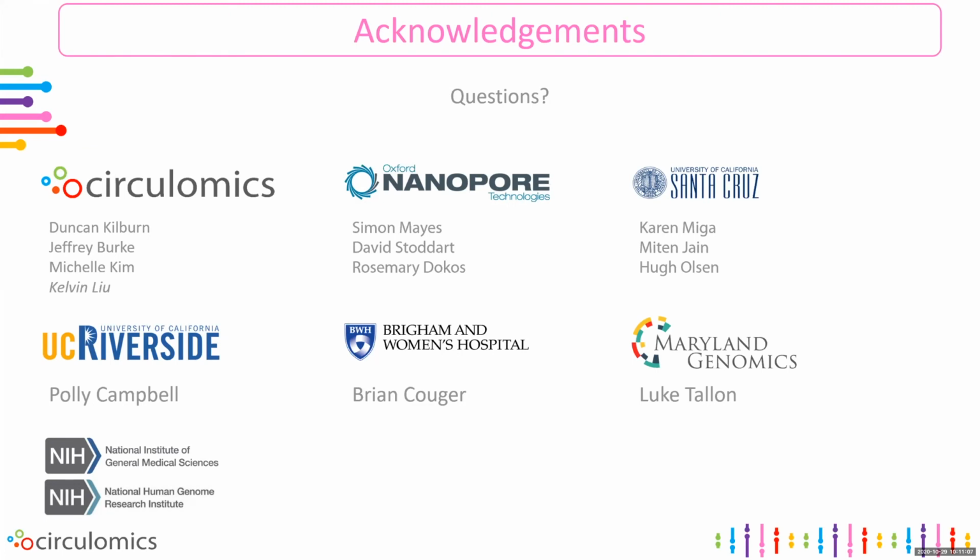Okay, and then the next one is with the latest ultra long data that you showed. Could you clarify? Did that use the ultra high molecular weight extractions and the UL library prep together? Yes, that requires both of those things. We have new ultra high molecular weight DNA extraction protocols that we'll be releasing at the same time as the library prep protocol. So you'll need to do the Nanobind ultra high extractions at the beginning to get the very large DNA, and then you'll need to purify it during the library prep with the second library prep kit. Okay.